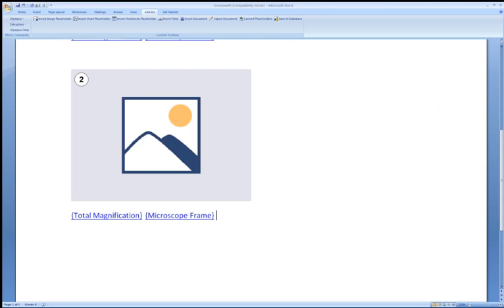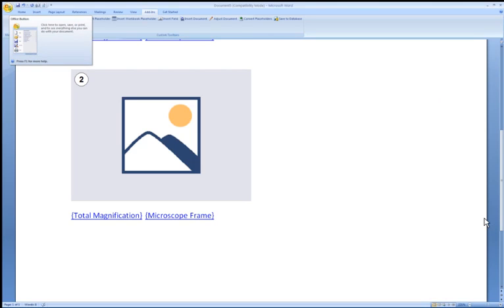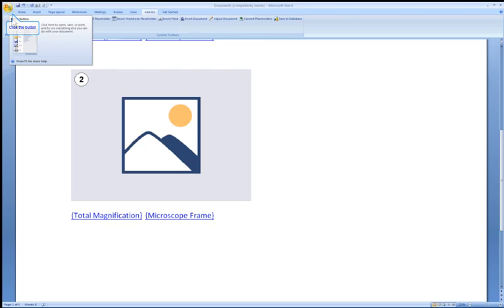We now have a new page template with two images with their corresponding fields. We now need to modify the properties of the Word document to have a thumbnail image saved along with the document. The thumbnail image will be displayed within Stream to show you the layout design.